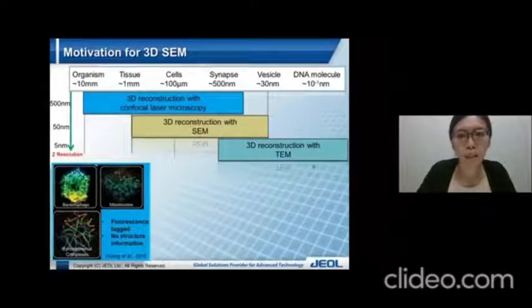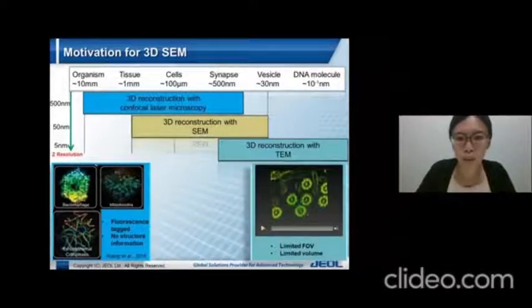So SEM and TEM open up the view of three dimensions into ultrastructural analysis. 3D TEM can offer the highest resolution for tissue volumes. It can allow us to observe smaller cellular structures at sub-nanometer resolution. For example, here in these 3D tomographies, we can observe the cross-sections of the cilia, showing the 9+2 microtubules very clearly. However, there is a limit on the volume, whereby it depends on the number of sections that can be imaged and the section thickness that allows the electron to pass through. The field of view is seriously restricted. It is difficult to observe the whole image of the cells or tissues.